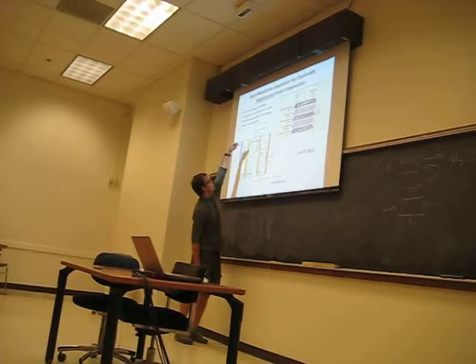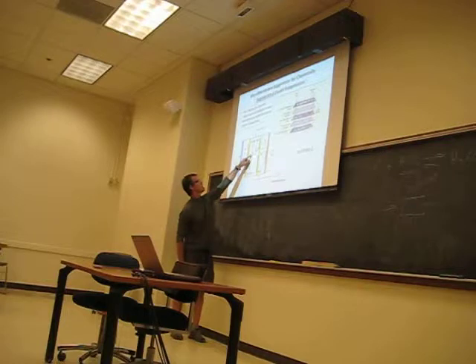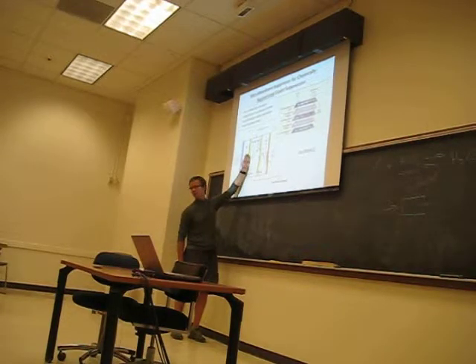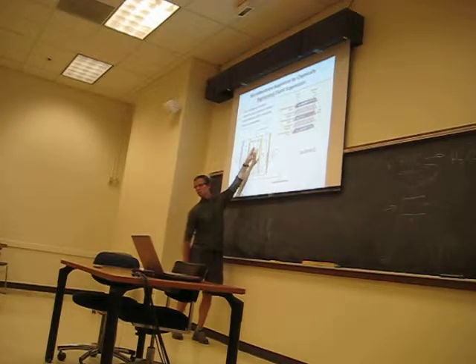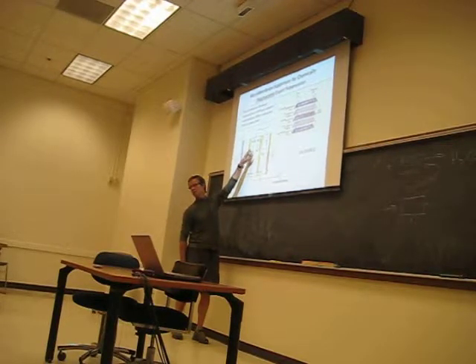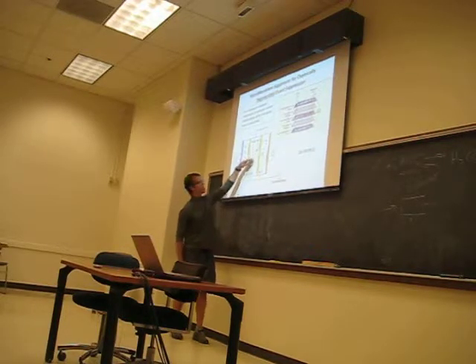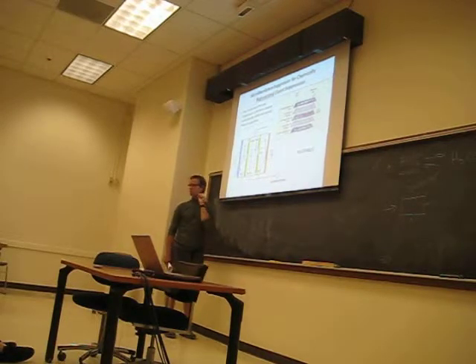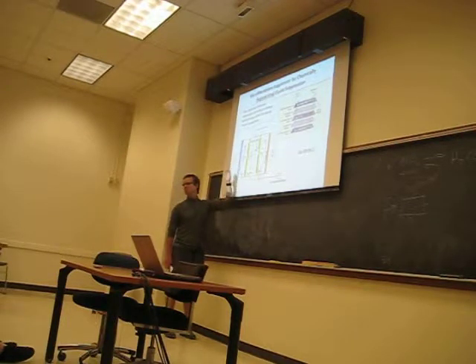So in this process, you have all your anions coming through, including a high concentration of bicarbonate, and the bicarbonate is then combining with a relatively high concentration of protons that are diffusing and immediately reacting at this surface with the bicarbonate to form carbonic acid. And it's non-conducting, and the sodium is diffusing out. So you're depleting this space of the interfering anion and the high interfering cations before it flows out and into the detector. And so when you turn the suppressor on and off, all that's doing is providing the potential to the anode and the cathode to start this electrolysis.